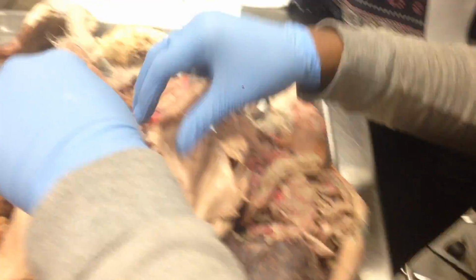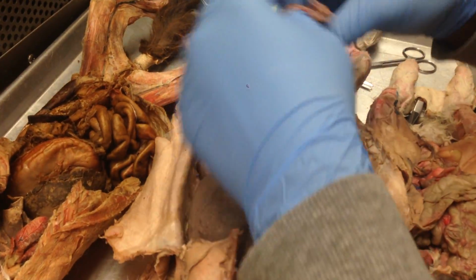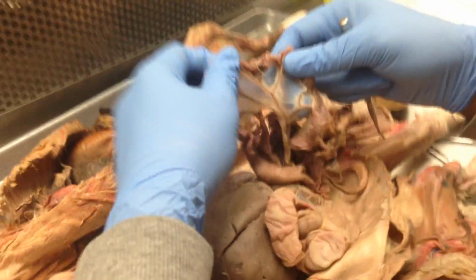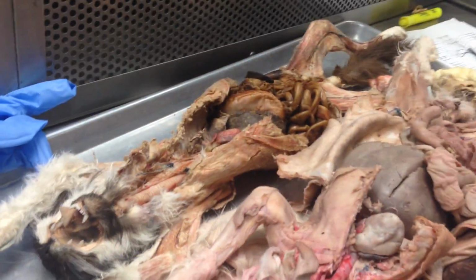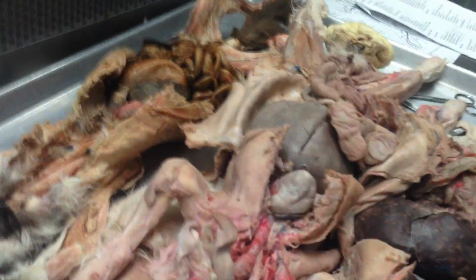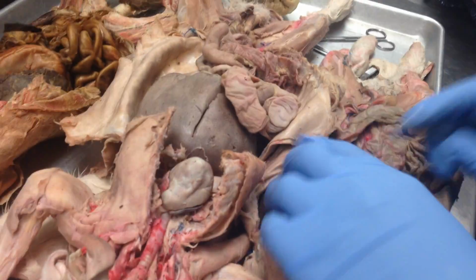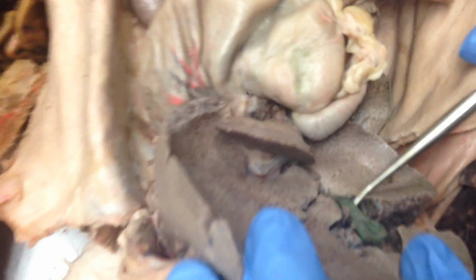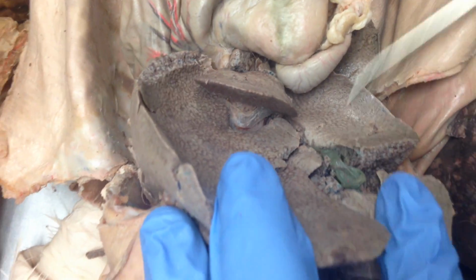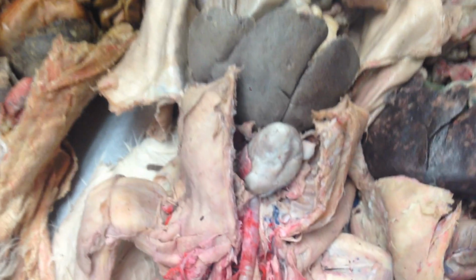And then the mesentery. You can find it on the small intestine, around the whole intestine. It's clearer here. All right, and then we have the liver, which is right here. The gallbladder is underneath the liver, kind of like a green sac, right there.